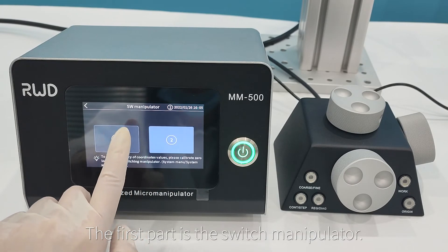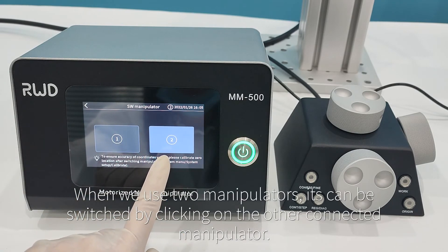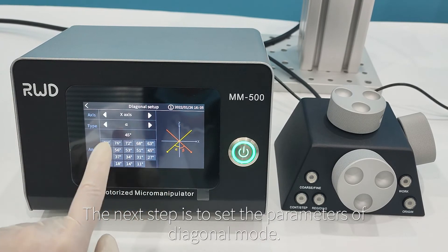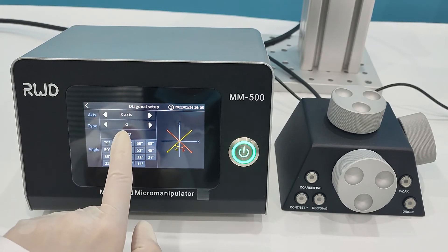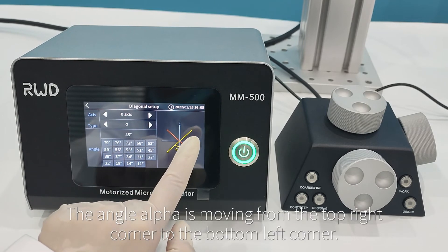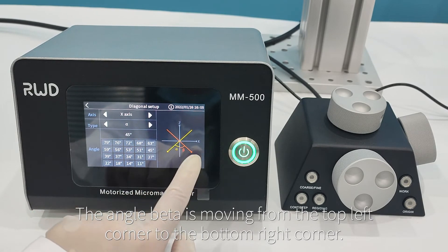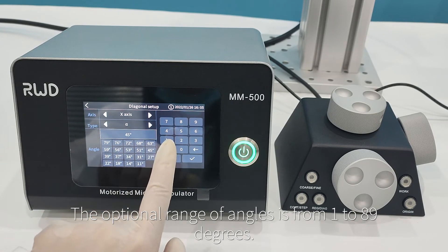The first menu section is switch manipulator — when using two manipulators, switch by clicking the other connected manipulator. Next, set the parameters of diagonal mode: choose X or Z as the main axis of movement. Angle alpha moves from the top right corner to the bottom left; angle beta moves from the top left corner to the bottom right. The optional range of angles is 1 to 89 degrees.